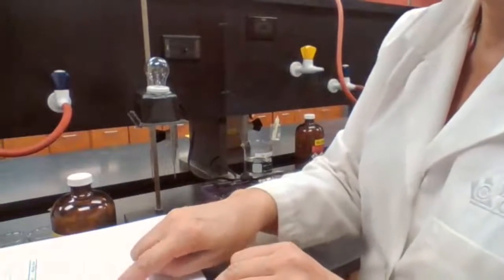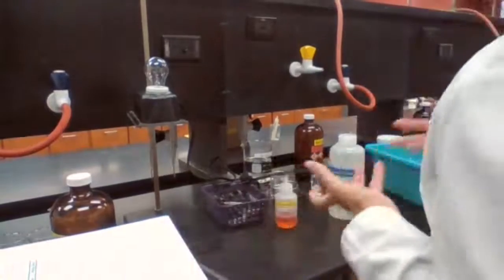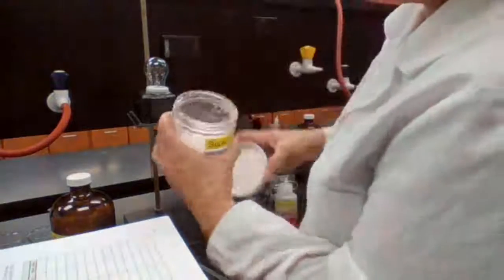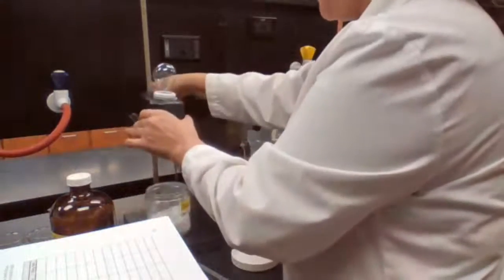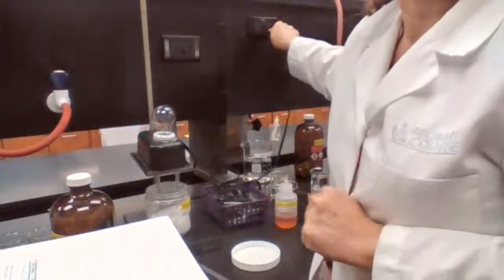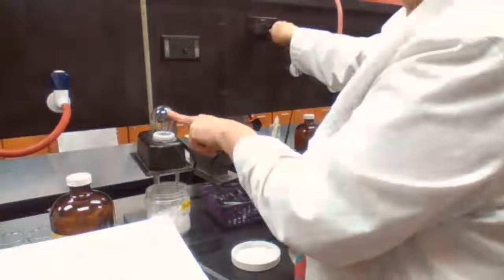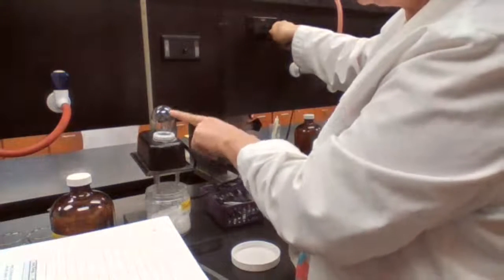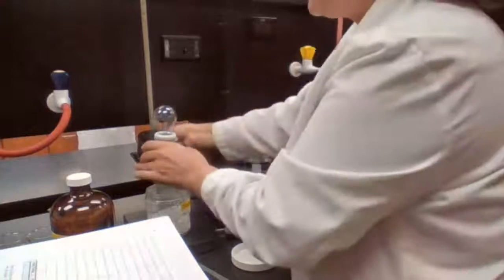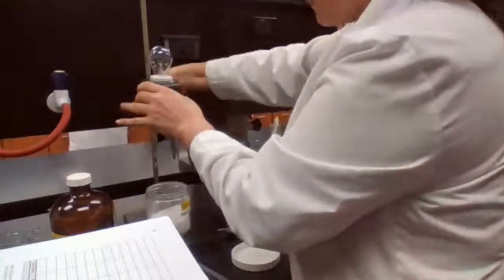After the aqueous, then we have sucrose. What to expect from sucrose? Is sucrose electrolyte or non-electrolyte? First of all, it's solid. Even if it was ionic, it would be non-electrolyte because it's a solid compound. But besides that, sucrose is a molecular compound. Since sucrose is a molecular compound, I'm not surprised it is non-electrolyte. It does not have any ions.